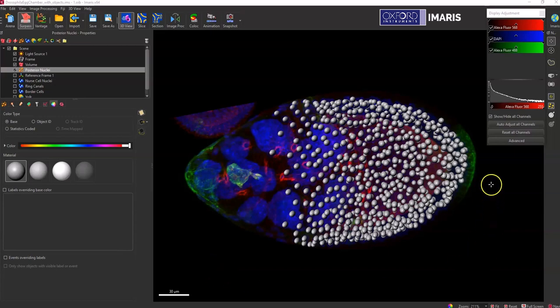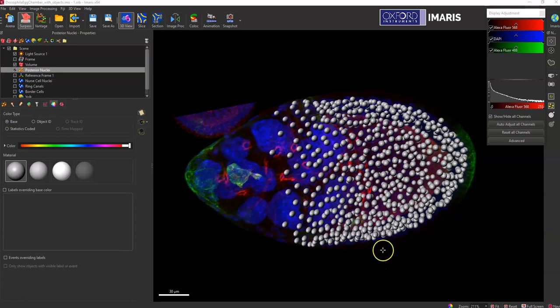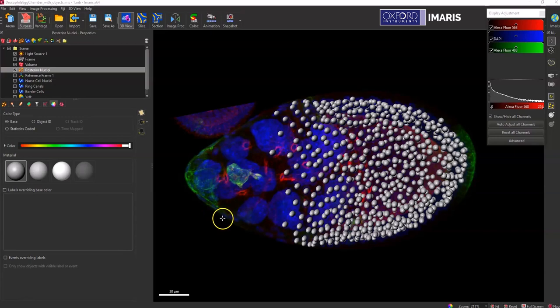Today I'm going to show you how to make a subpopulation or a subselection from your total population here. There's a couple of different ways you can do it.